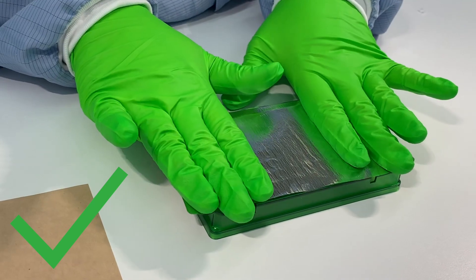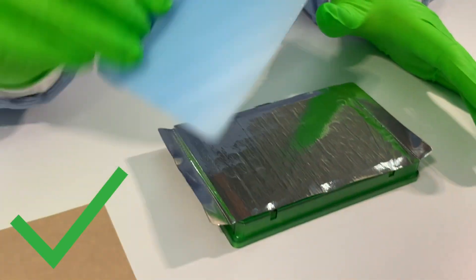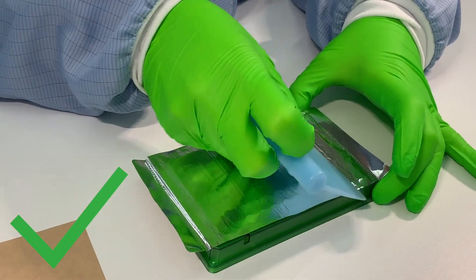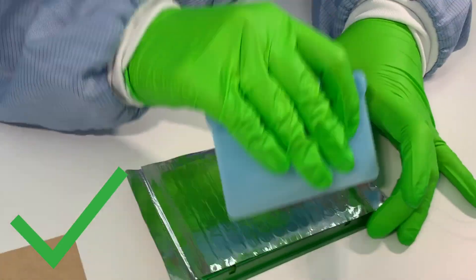Slightly press the seal down. Take the plate sealer and firmly pull it over the plate from left to right and then from top to bottom.